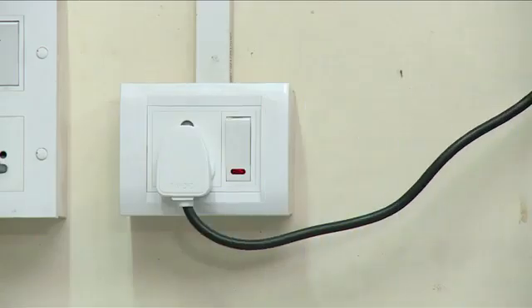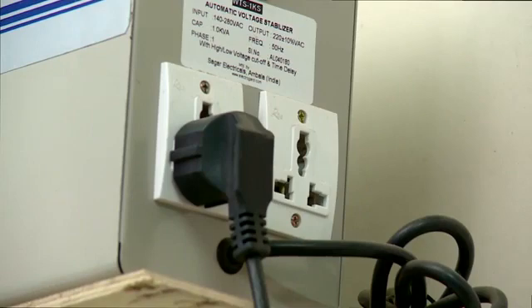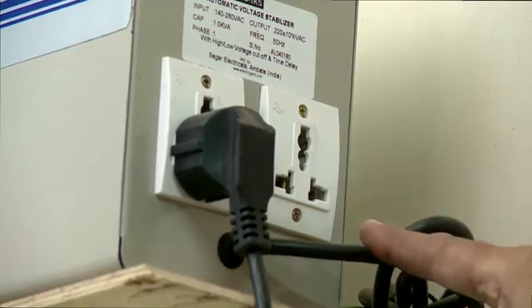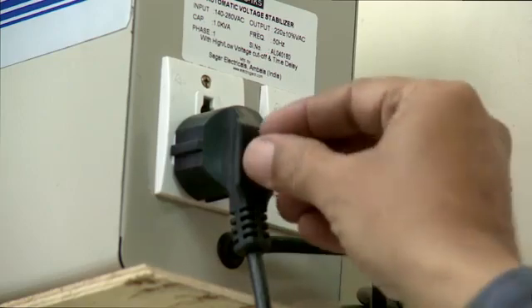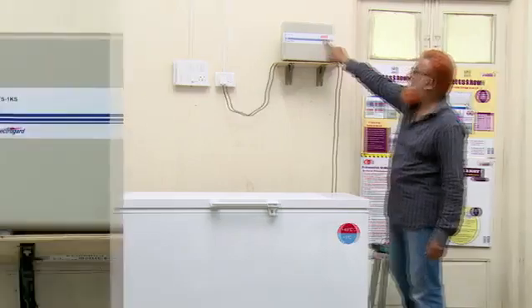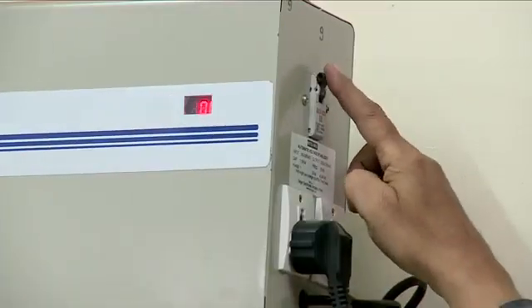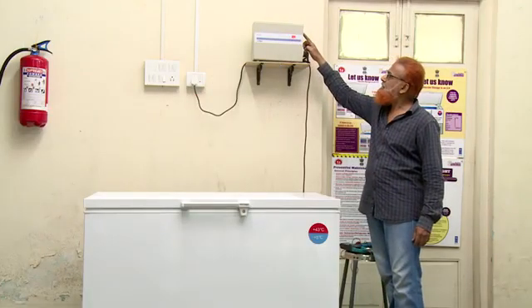Ensure the healthy condition of the mains power board and supply cord, and that the cold chain equipment is connected to a voltage stabilizer. Check the condition of the electrical socket of the voltage stabilizer and the proper connection of the 3-pin top plug for the load cable or CCE cable. Check the input/output voltage in the voltage stabilizer. Ensure proper functioning of the MCB switch and verify the operation of the quick start switch if present.